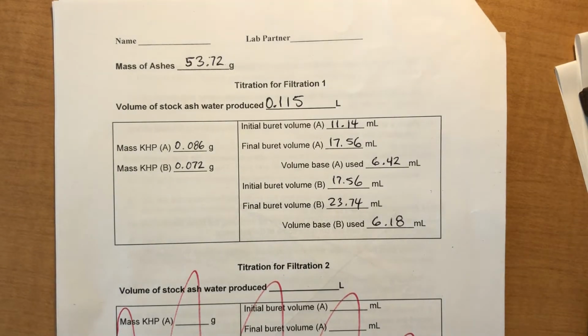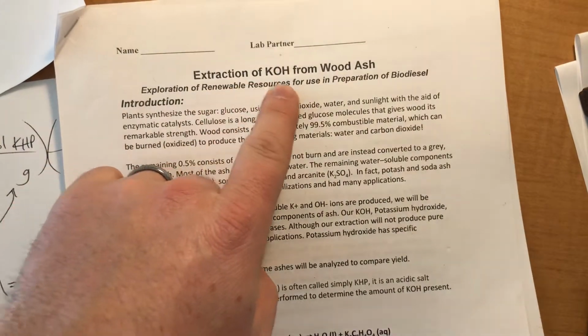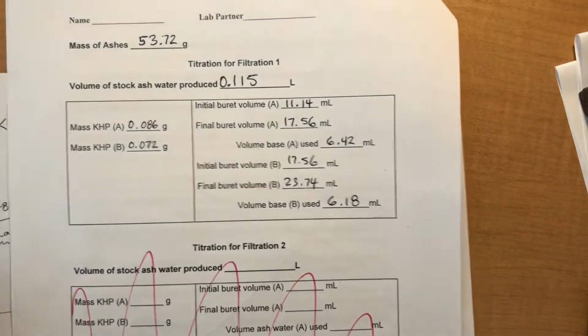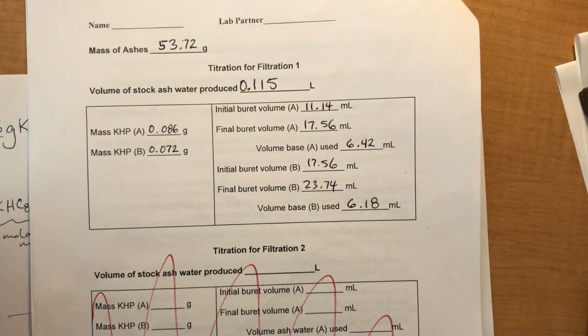Alright, in this video we're going to do a quick discussion of how to work through the calculations for the extraction of KOH in wood ash. I am not going to plug in all the numbers, and I made up these titration numbers. They are probably nothing like what your numbers are. I want you to use your numbers.